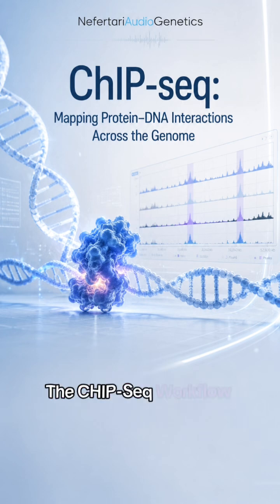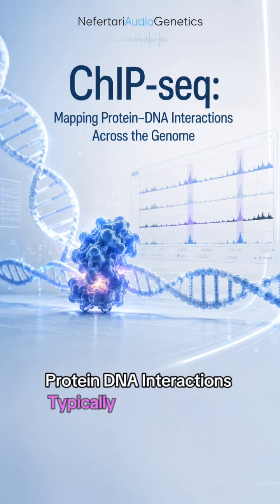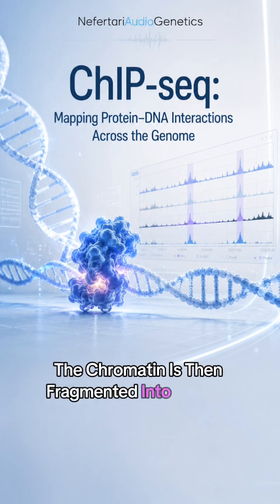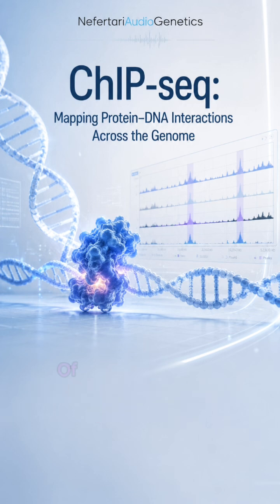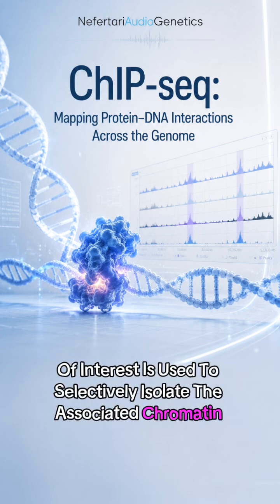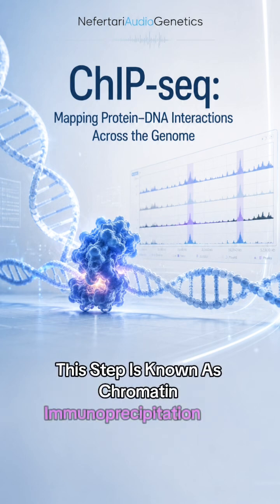The ChIP-seq workflow begins by preserving protein-DNA interactions, typically through cross-linking. The chromatin is then fragmented into smaller DNA fragments, commonly using sonication or enzymatic digestion. Next, an antibody specific to the protein or histone modification of interest is used to selectively isolate the associated chromatin fragments. This step is known as chromatin immunoprecipitation.